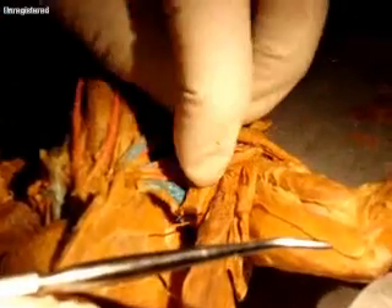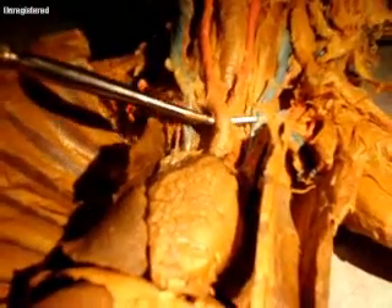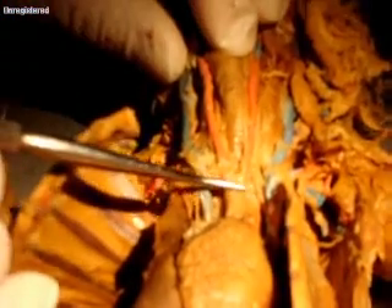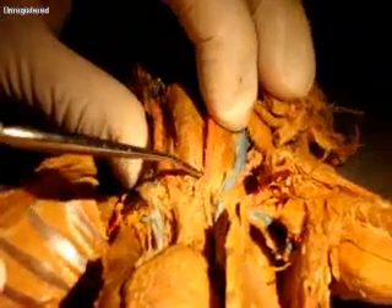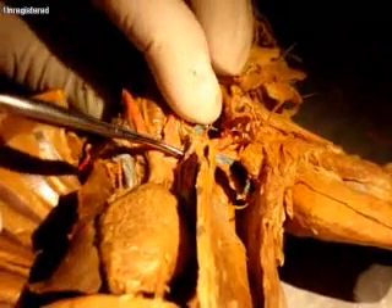Sorry about that confusion. Looking at the arteries, we have this little short brachiocephalic here. This is actually the ascending aorta, this is the aortic arch, and then it's going to go down and become the descending aorta. We've got the little brachiocephalic coming up here, and then the brachiocephalic is going to split to form the right and left carotid arteries.